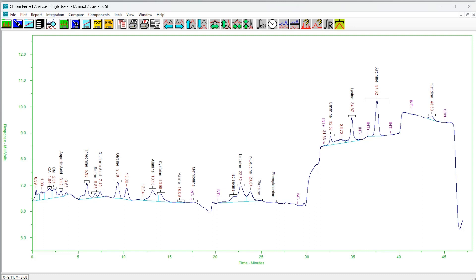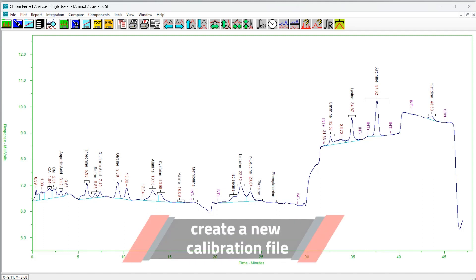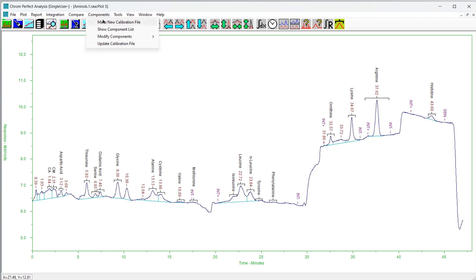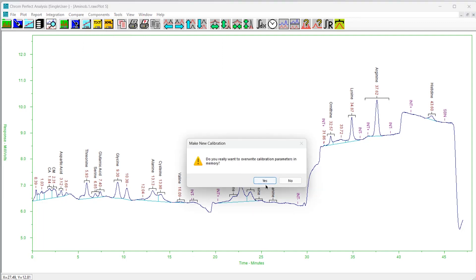Note that calibration file adjustments within the Analyze program are seldom complete. At the very least, the calibration file will require updating frequently. It is necessary to use the calibration editor form to set the default component retention time references, internal standards, and so forth.